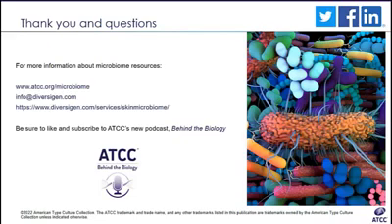Also, I think it's worth mentioning that we are working on a solution to get shotgun sequencing information from skin microbiome samples. And as I mentioned very briefly, we know that shotgun sequencing provides information on viruses and fungi on skin, which some of you may be interested in. I would say the main disadvantage of using shotgun sequencing for low biomass samples is usually the amount of host DNA that you can sequence, unless very specific changes are made to the pipeline, as we are working on here at Diversigen.